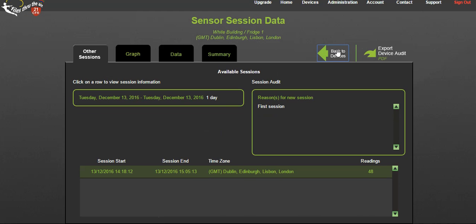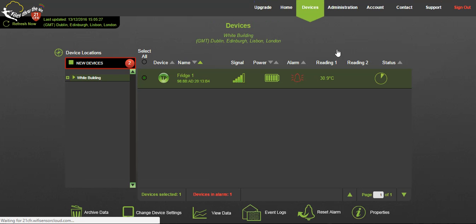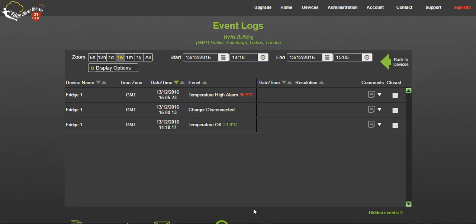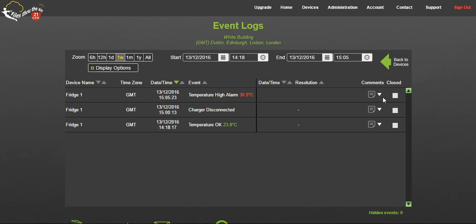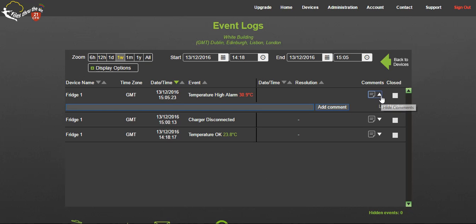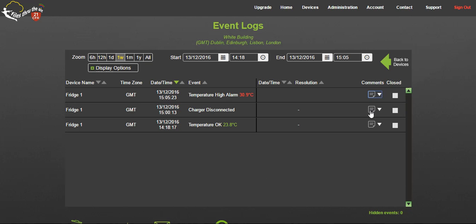Back on the dashboard, selecting event logs will show all activity on each device in a simple to read format. Events may include a charger disconnect, an alarm or connection loss. A time and date stamp against each event is shown to the right and if you wish you may record a comment explaining why it occurred.